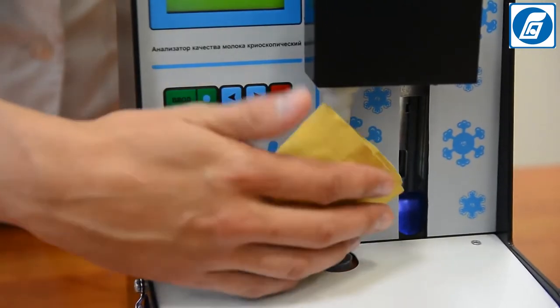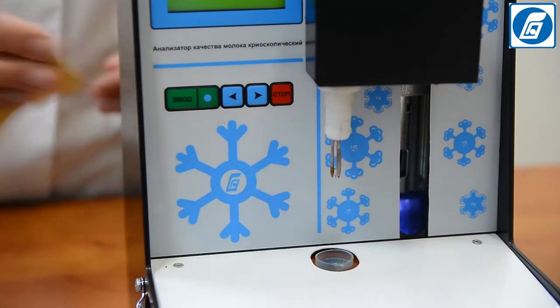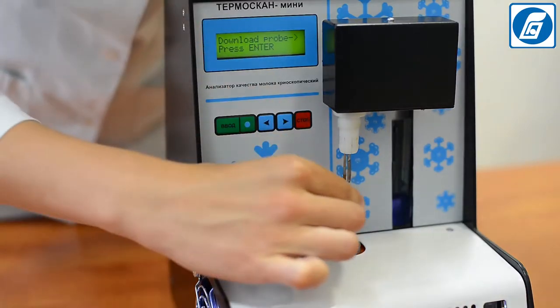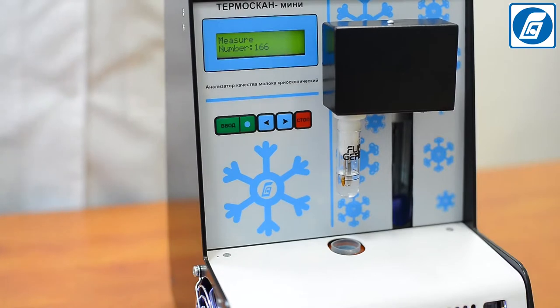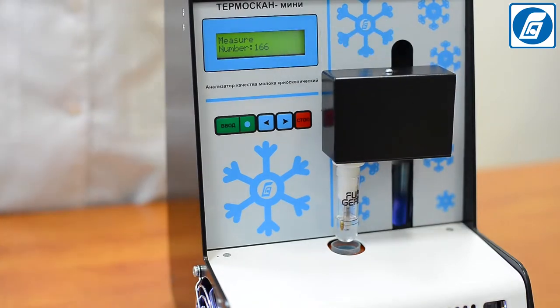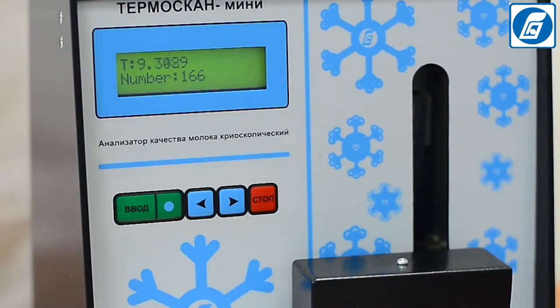Make sure that the probe and the wire for stirring are clean and dry. If necessary, wipe them with a soft, clean, non-fibrous tissue. Insert a test tube with standard solution into the sample receptor of the analyzer's cooling bath and press Enter. The cooling process will begin. On the top line of the indicator, the temperature of the liquid in the cooling bath is shown; on the bottom line, the temperature of the sample is displayed as it decreases.